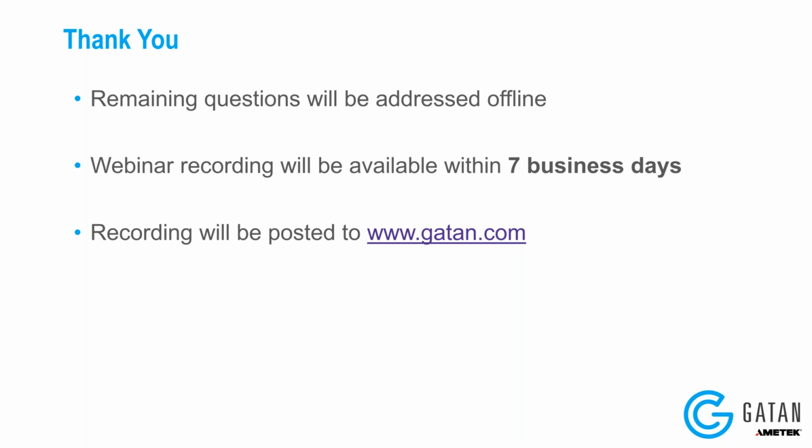So the K3, Alpine, Metro, those are direct detection cameras. I didn't talk about it in this presentation, but a direct detection camera doesn't have a scintillator, and that makes it more sensitive.